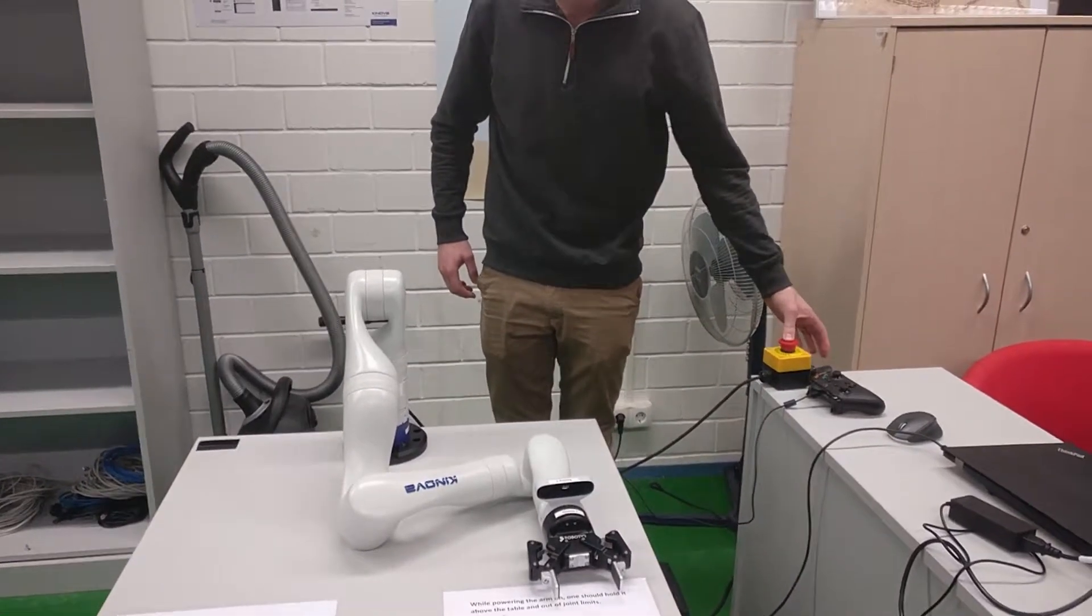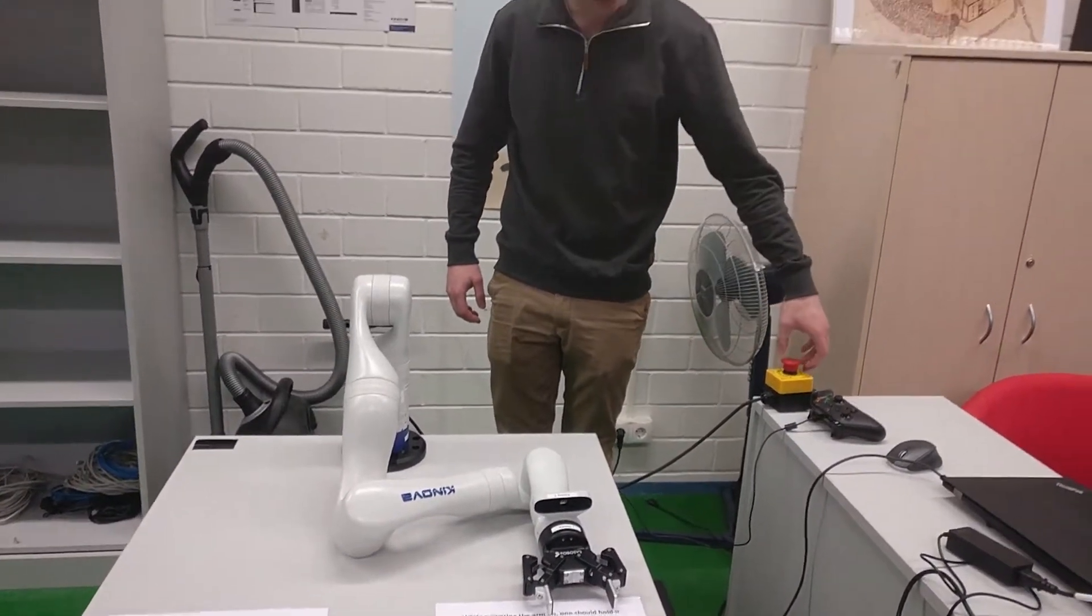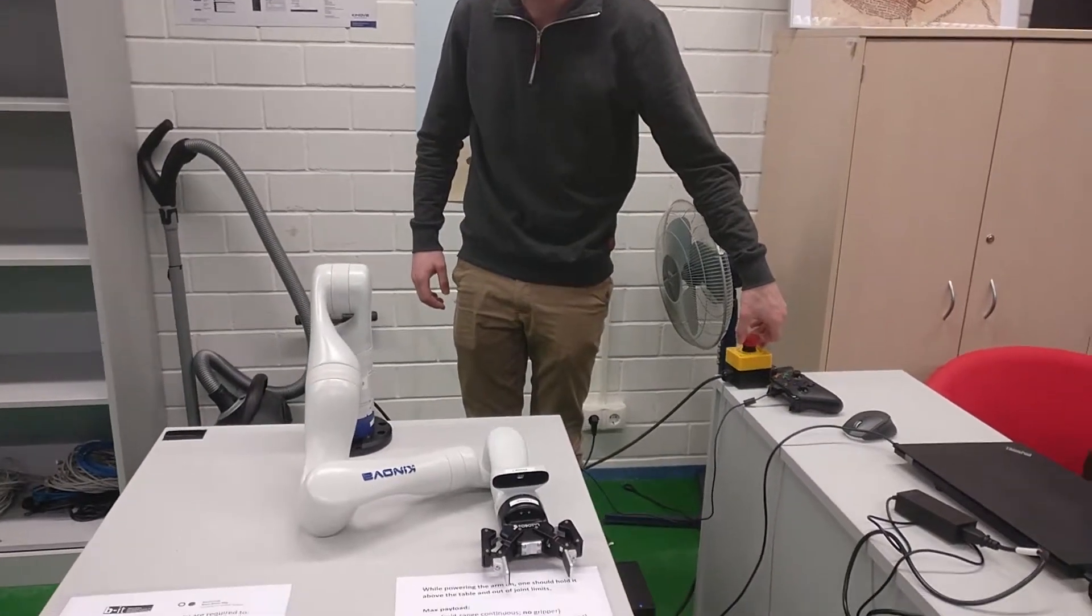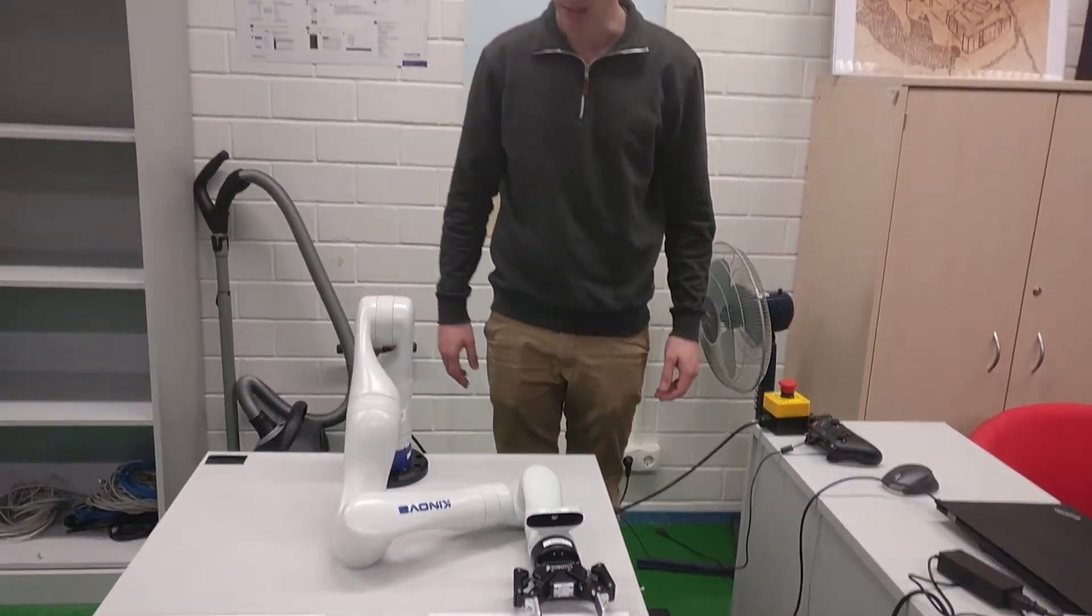When the emergency stop button is down, there is no power to the robotic arm. To power up the arm, you need to turn and it will pop up. The robot arm is now powered.